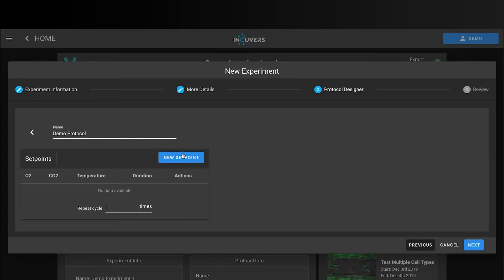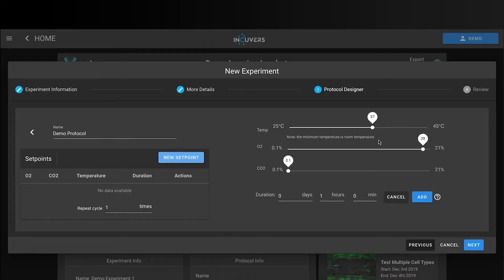Pre-program ischemic events, heat shocks, and hypoxic fluctuations with the Incuverse protocol designer. Get smart with your incubators.